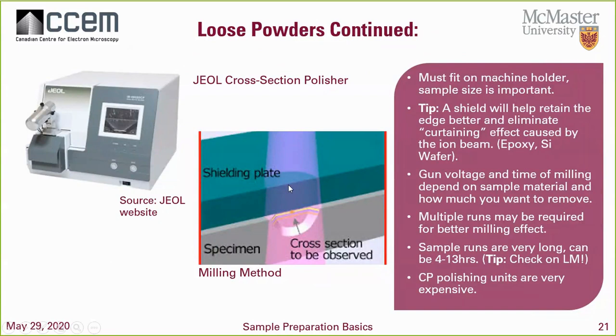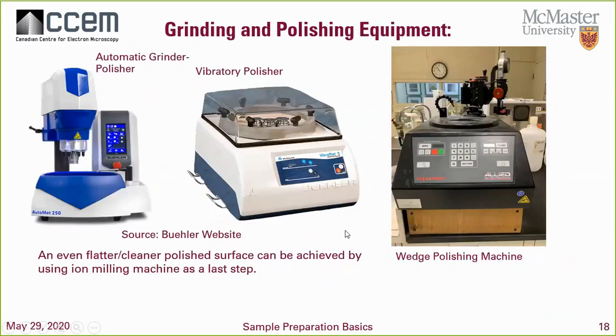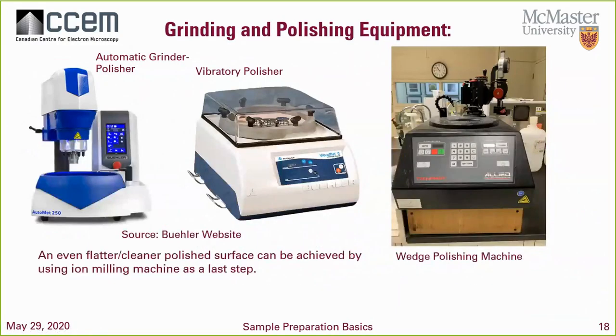Do that. But also, I recommend using mostly the wedge polishing unit, because in that way you can get a nice flat surface. But if you're mounting those samples, just remember you have to coat them, and you'll probably have to add a little bit of nickel paint.